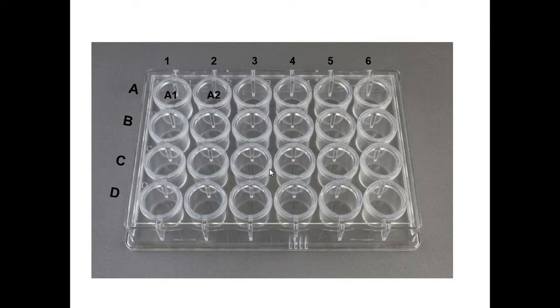And those wells are where we would put different combinations of chemicals. We would refer to that as our buffer. And so we would put those in those trays, and each well is marked with a letter and number designation. So you can see A1, A2, A3, A4, A5, and A6 across the top.